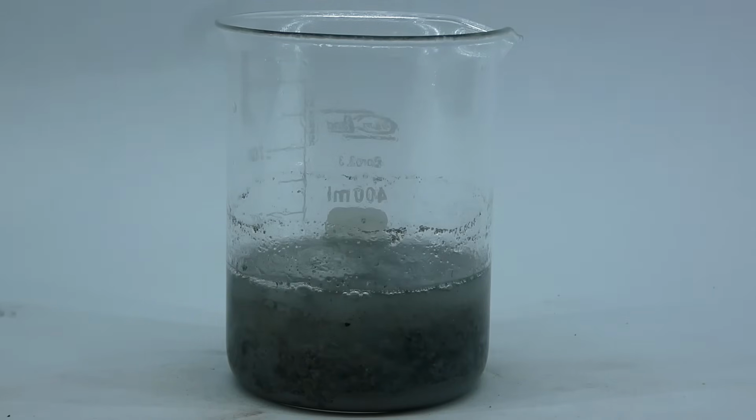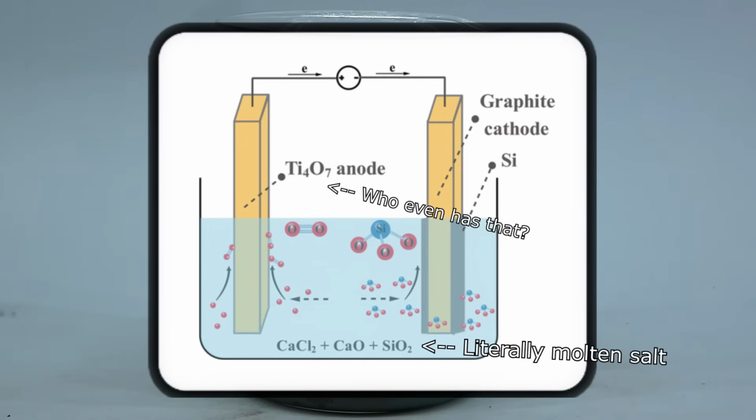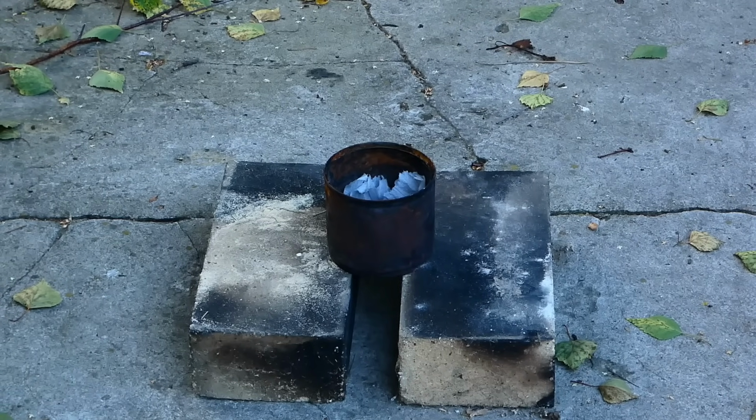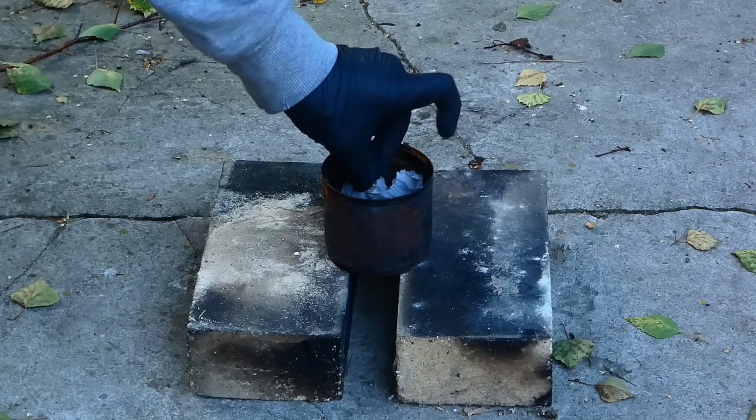The first one is the electrolysis of molten silicon dioxide, which is ridiculously complicated, requiring very expensive equipment and a constant temperature of over 1700 degrees Celsius, which is just way beyond my capabilities. The second method, however, is much more accessible to the amateur and involves the use of a thermite reaction.